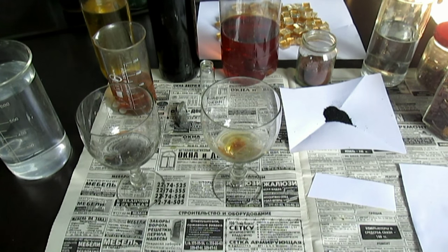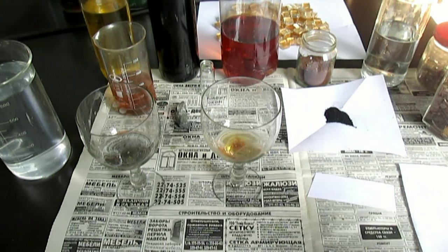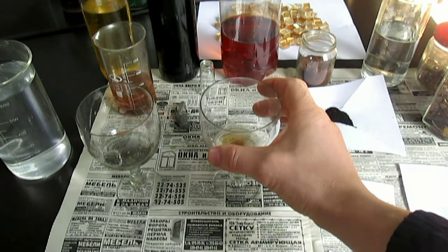У него уникальное свойство: он впитывает в себя молекулы, и они там как будто застревают. Он не выделяет осадок, а ловит молекулы золота. Что само по себе уже уникально. А дальше просто этот осадок собираем, обрабатываем, дорабатываем его и получаем чистый концентрат золота. Этот порошочек я испытал, и немножечко был шокирован результатом. Я об этом ещё сделаю наглядное видео.